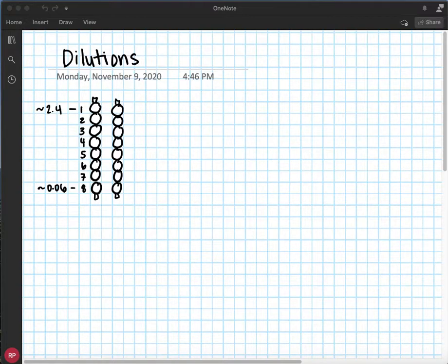As long as your samples read within this range, you're totally fine to do a full run with whatever dilution gave you that. But it's important to balance how much sample you're using, the OD value, and where it lies within the range of your standards, just to make sure that everything fits in and you're being as conservative as you can be with your samples. So let's say in this example I have both the cortex and the hippocampus to run.